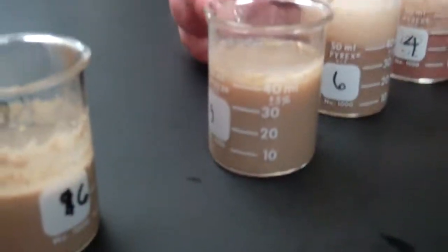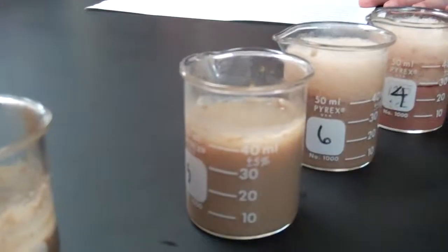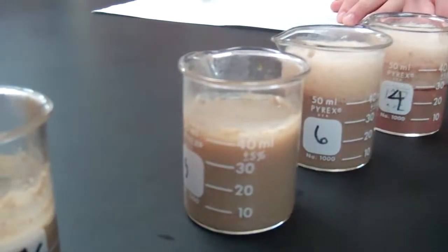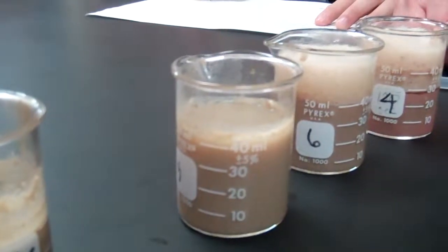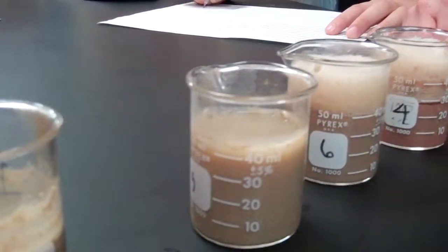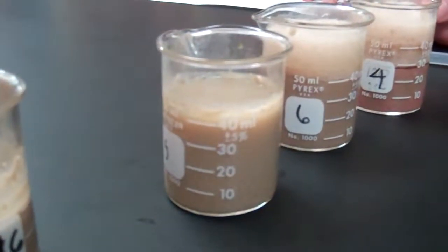The acid one, there was no reaction. All right, when we added hydrogen peroxide to the raw, it bubbled and fizzed. It did nothing here. So what's missing? Maybe it wasn't the enzymes. Maybe it wasn't like the lock and key type of thing where it just doesn't fit into it. So why would it not fit into it? Competitive inhibitors. Denaturing. Very good.